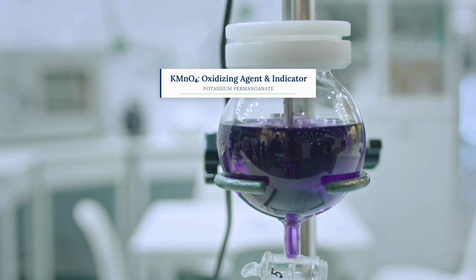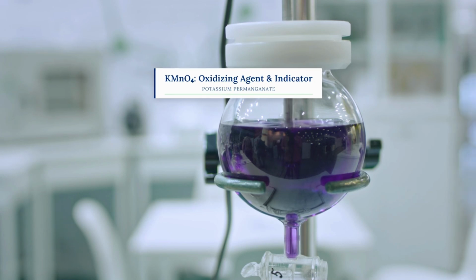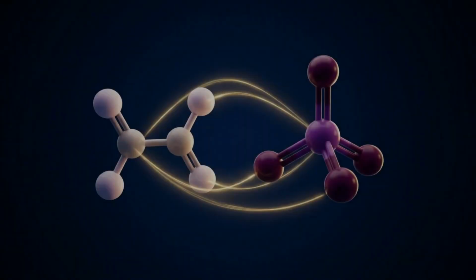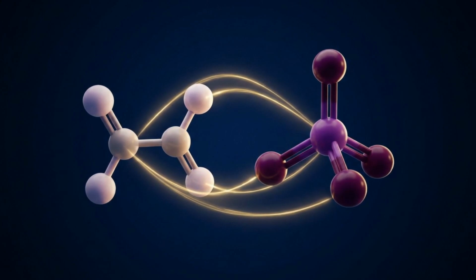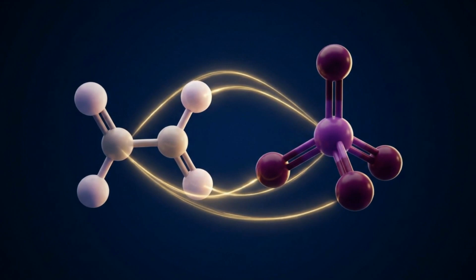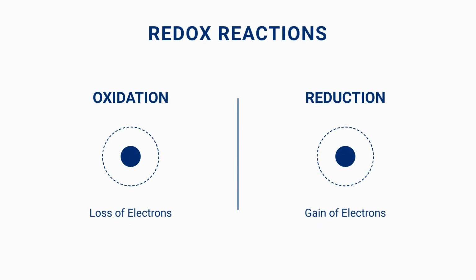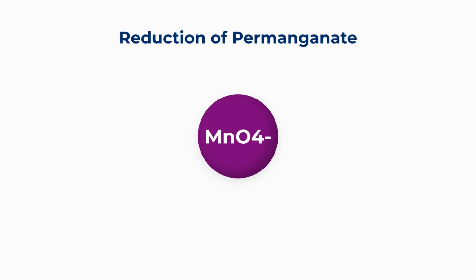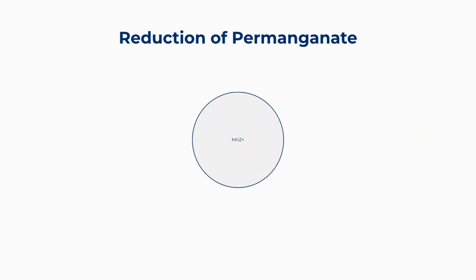Unlike acid-base titrations that rely on an external indicator, this experiment uses potassium permanganate, which serves as both the oxidizing agent and the indicator. Oxidation reduction reactions, often called redox reactions, involve the transfer of electrons between substances. One species loses electrons and is oxidized, while another gains electrons and is reduced. In this experiment, potassium permanganate acts as the oxidizing agent, accepting electrons from the oxalate ions. As the reaction proceeds, permanganate ions are reduced to manganese ions.